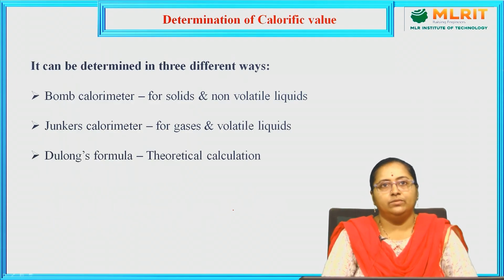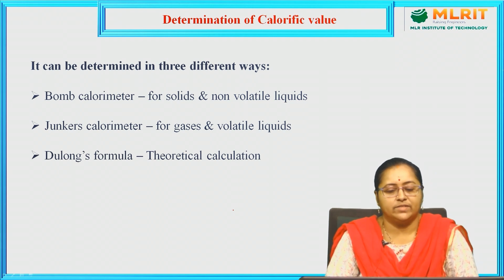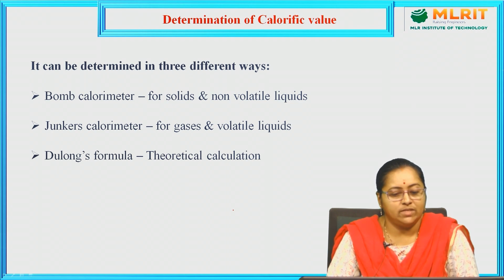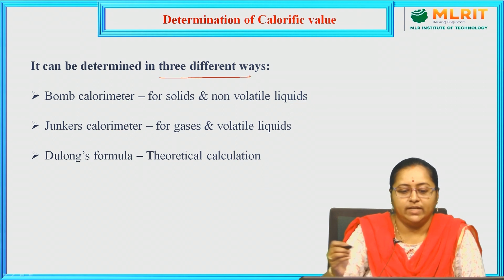Now we are going to learn how to determine the calorific value of a supplied fuel sample. Fuel samples can be in solid, liquid or gaseous form, or if you go very deep, we can say volatile, non-volatile, like that also. Based on the state of matter of the fuel sample that is supplied, we have three different ways of calculating the calorific value of the fuel sample. Let us see what those three different ways are.